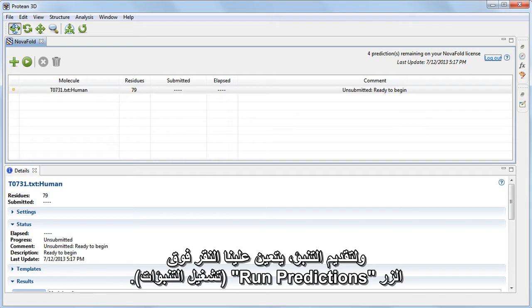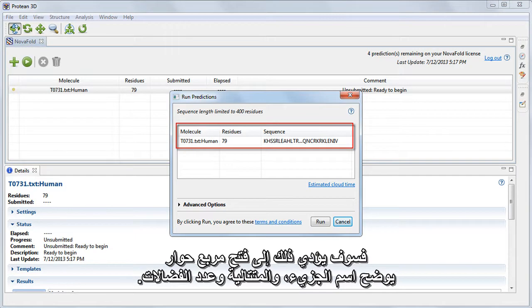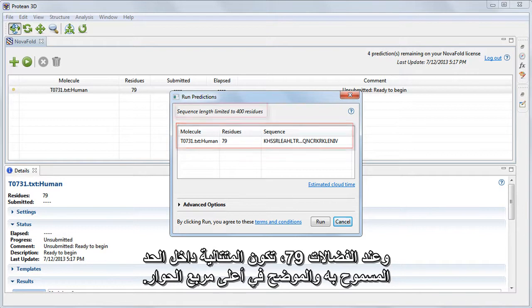To submit the prediction, we need to click on the Run Predictions button. This opens a dialog showing the molecule name, sequence, and the number of residues. At 79 residues, our sequence is well within the allowable limit shown at the top of the dialog.